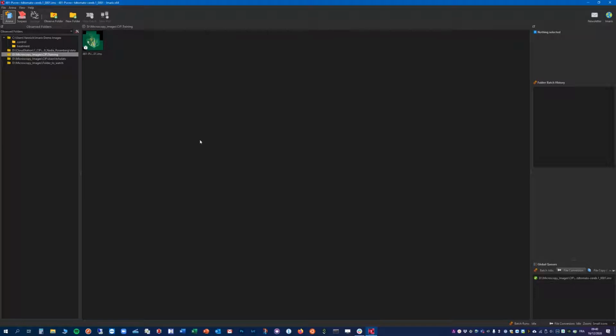Okay, so in this video I will try to show you how to prepare your dataset for analysis using Imaris. What we have here is a dataset already converted into the IMS format, the Imaris native file format.